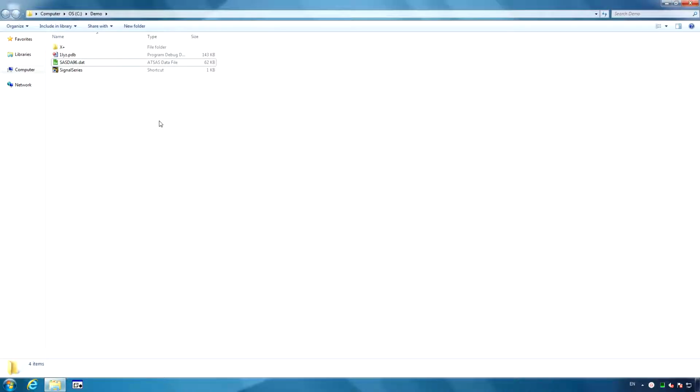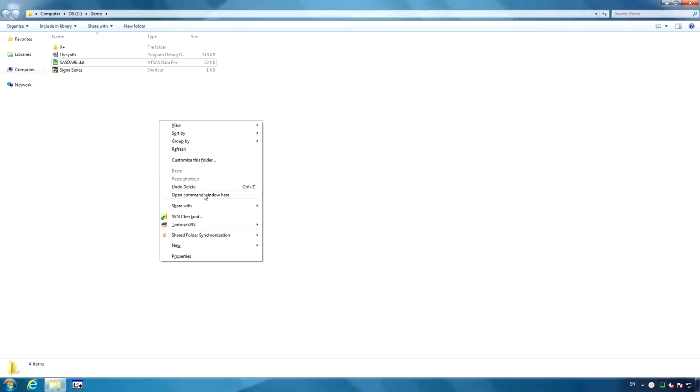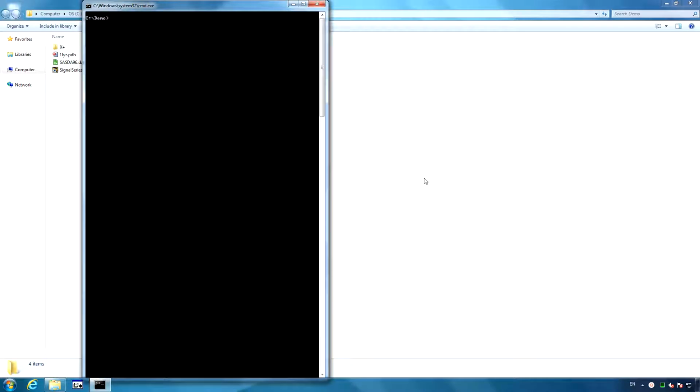In this tutorial we shall show you how to run the DebyeCalculator executable, which computes the solution scattering intensity of an atomic model, where the model is given as a PDB file. This executable is suitable for both CPU and GPU, and is using Debye formula. You run the software from the command line.